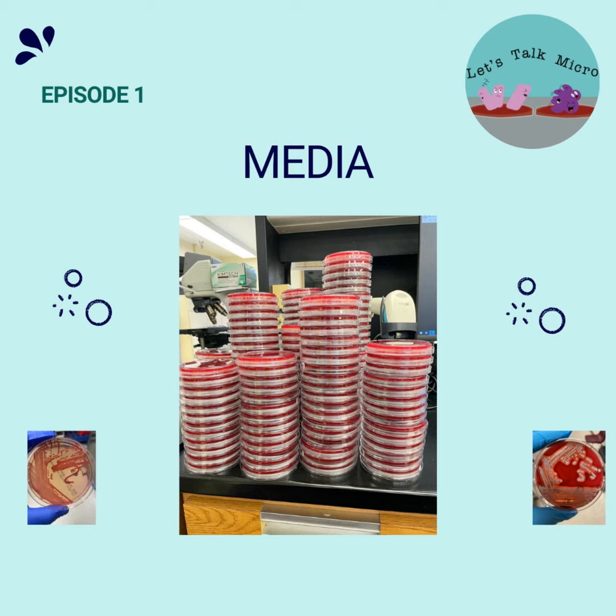And you stick that loop in your urine, and then you basically start going from side to side on that first quadrant, and then you turn your plate about 90 degrees, a little bit less. Then, bringing your loop from your first quadrant, you start streaking that second quadrant, making sure that at this point the space is not as crowded as in the first quadrant, and you repeat the same process twice.